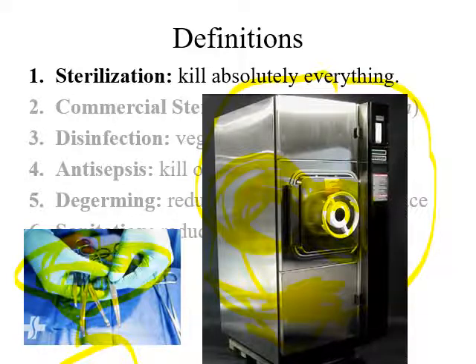So operation of an autoclave is actually quite dangerous, and so not everybody is allowed to use an autoclave because it can be quite dangerous. You have to be trained how to use the autoclave first. But once you've been trained, it's actually quite simple to operate.